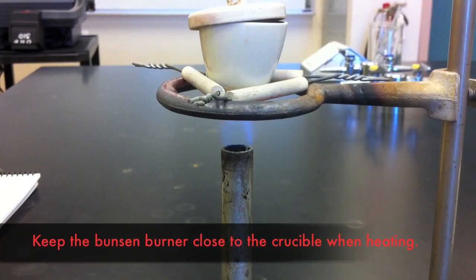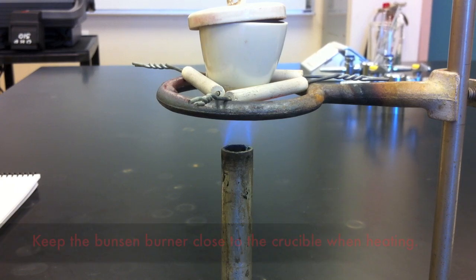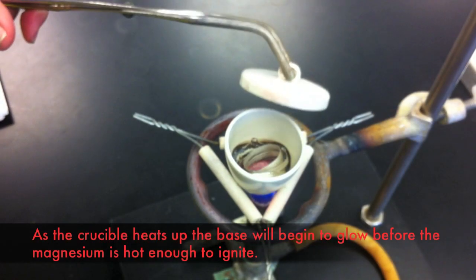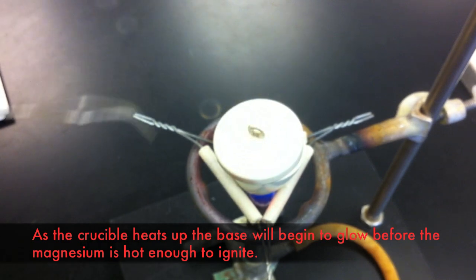In order for this reaction to proceed properly, you need to make sure that the Bunsen burner is close enough to the crucible to heat it well. The high temperature will cause the magnesium to ignite, though first the crucible will begin to glow with the heat.